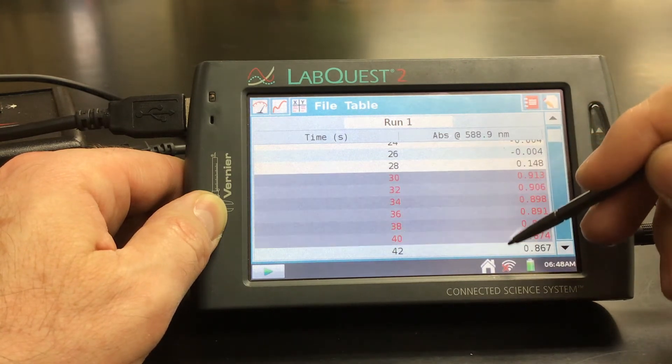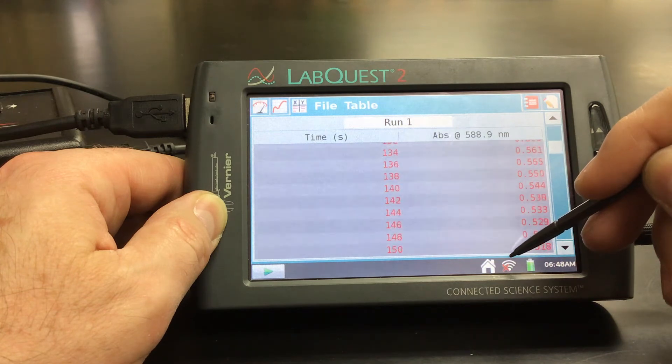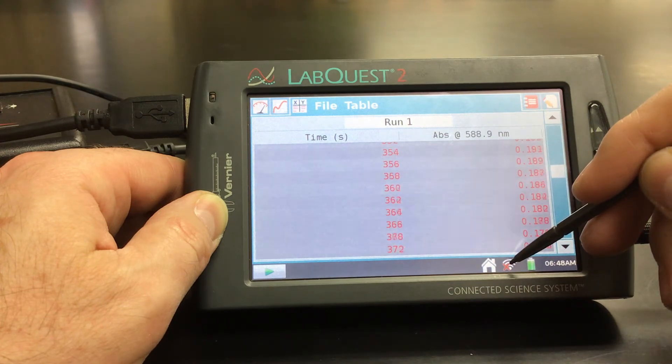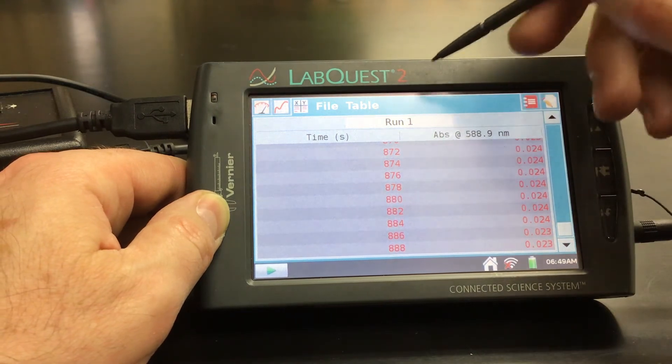I let it run because we had a time of about 900 seconds. If I hadn't messed around with it, we wouldn't need to do this — we already had it selected within the graph. But now we're just re-selecting everything here. There we go. So now under my table, I'm going to make a new calculated column.